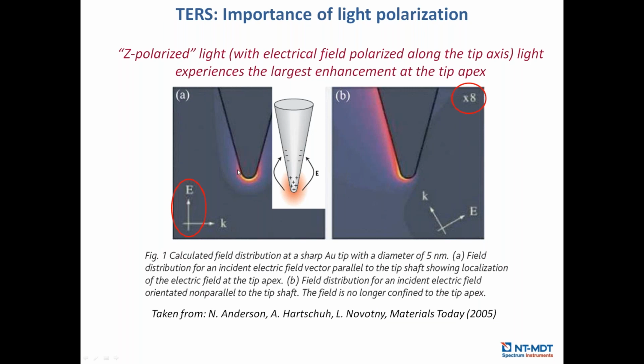What is also important is to have an electric field aligned in the Z direction along the tip, not perpendicular to the tip. Here we can see the modeling of the distribution of the electric field enhancement, and typically it is localized on the area correlated to the tip apex curvature.